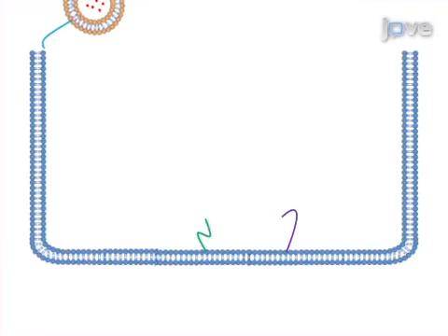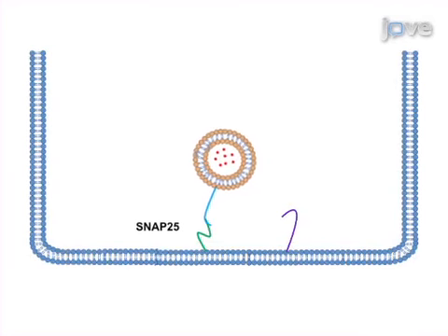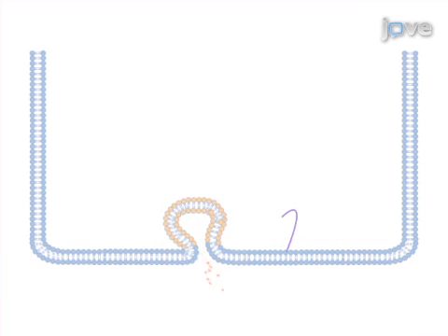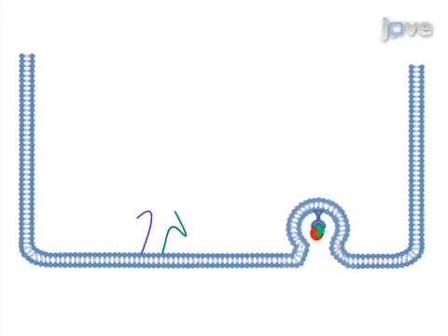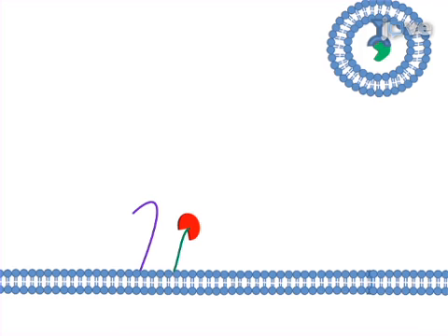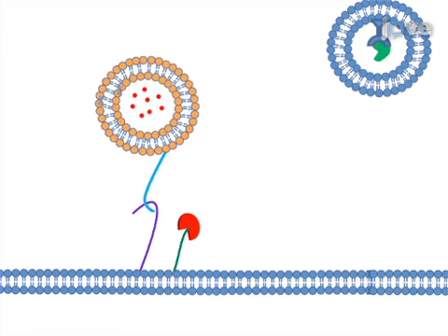During normal nerve signaling, the action potential causes SNAP25 to bind the synaptic vesicle to the plasma membrane of the motor neuron terminal, resulting in the release of neurotransmitter. However, when botulinum neurotoxin is present, it is taken up by endocytosis and released in the synaptic bouton, where it cleaves SNAP25 and so interferes with the release of neurotransmitter, causing paralysis.